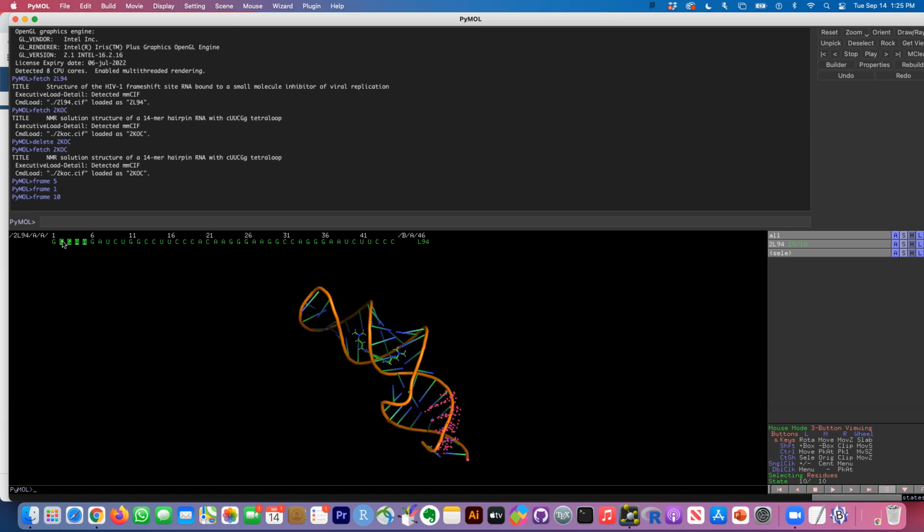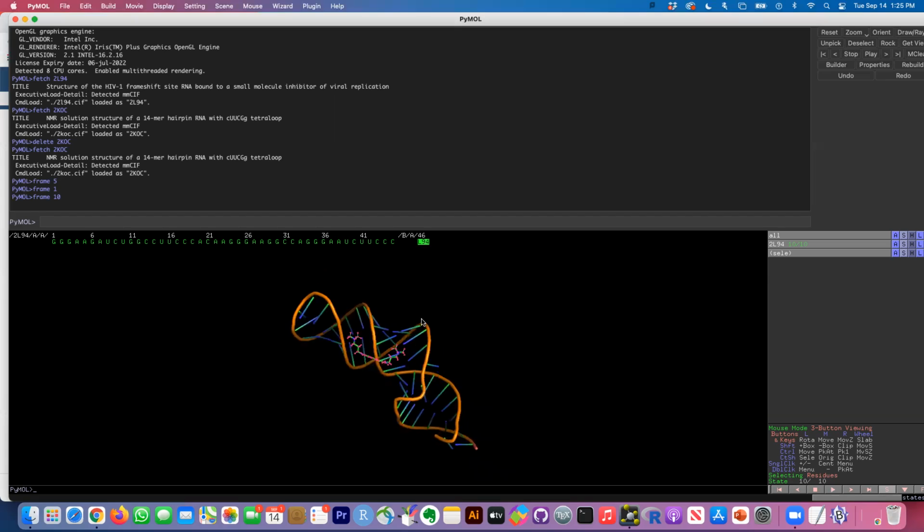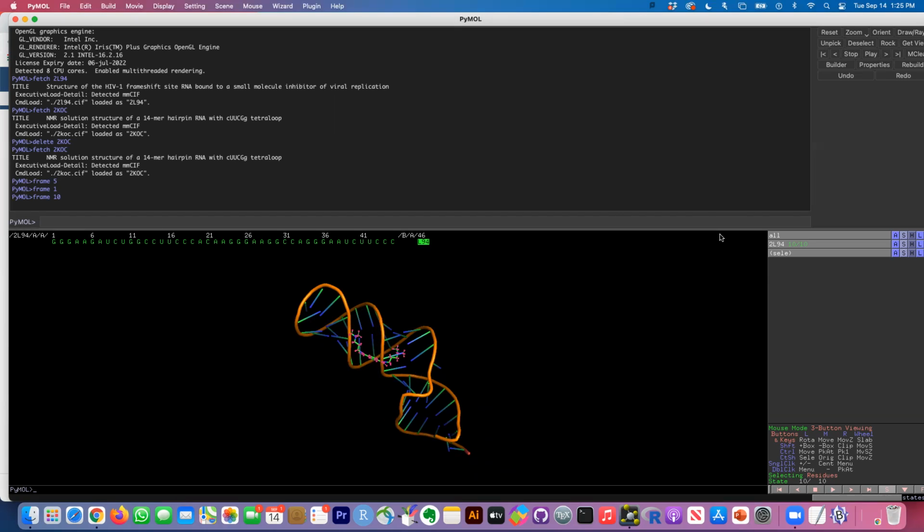If I want to clear a particular selection while working with a sequence, I can just click on the selected sequence and this selection goes away. Now, I mentioned that you can see in the viewer that you have this ligand here. And this ligand is actually associated with this sequence ID. And if you wanted to zoom, yeah?